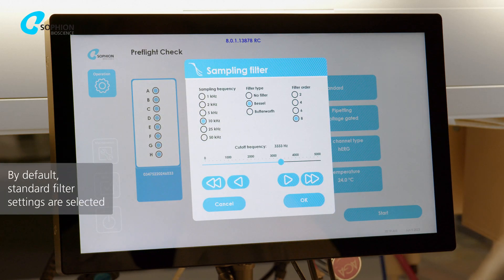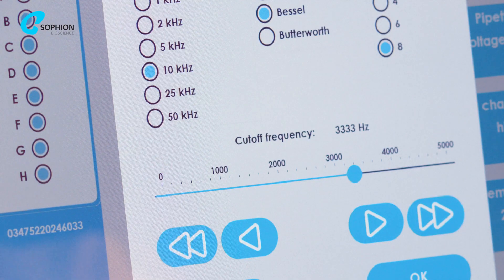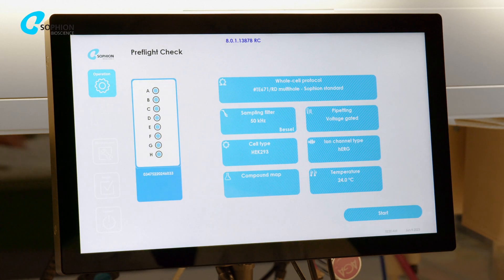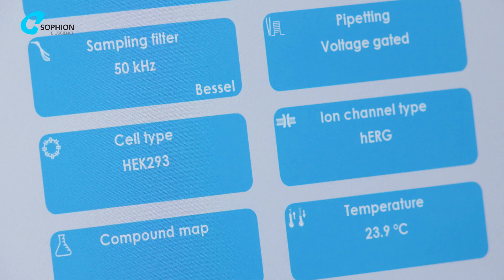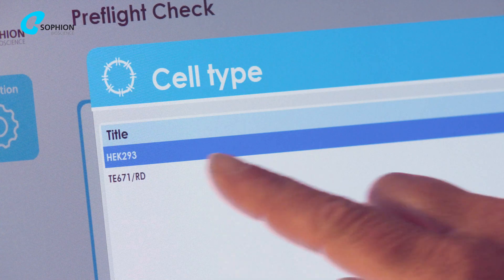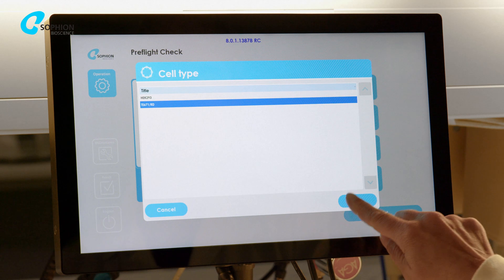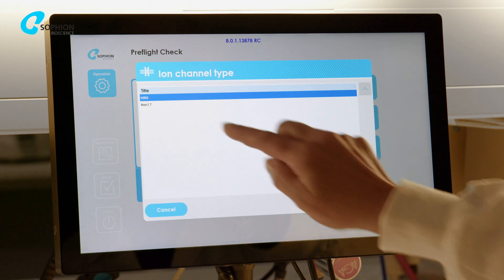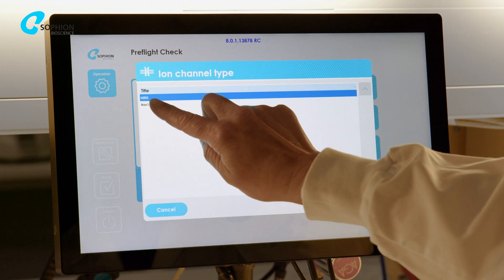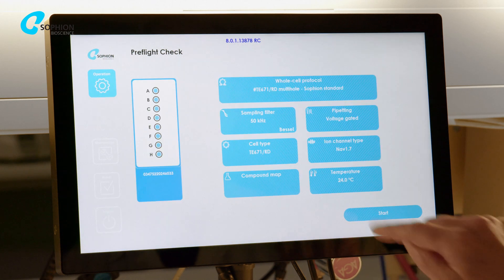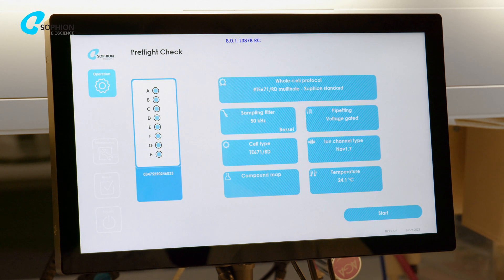You have the option to select the signal conditioning appropriate for your experiment. Identify the type of cell and ion channel you want to record. These lists can be edited in the Sofian analyzer software.